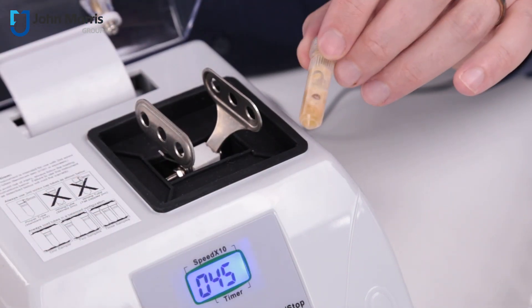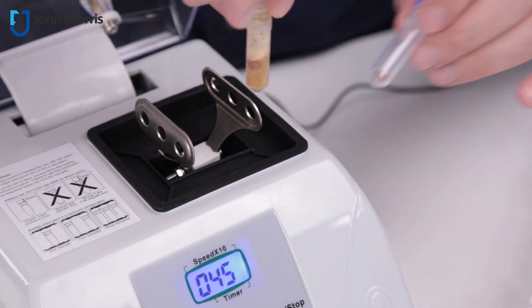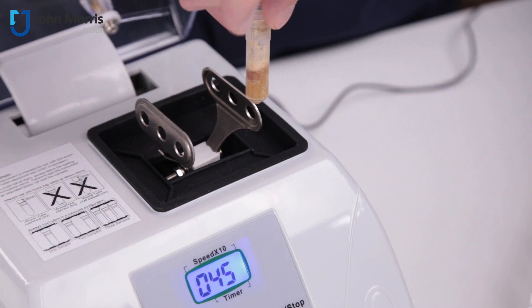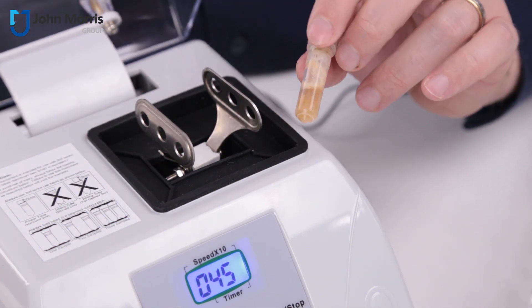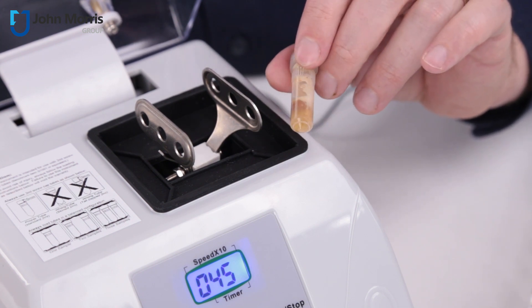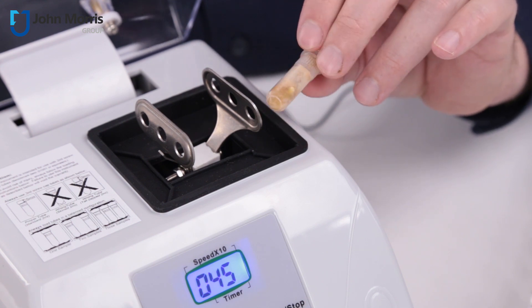You can see here we've put a very heavy bead in. The bead that went in this one is identical to this bead here. By bringing in a heavier bead, we've done quite a good job of actually breaking open that plant with the small flowers on top of it into suspension.